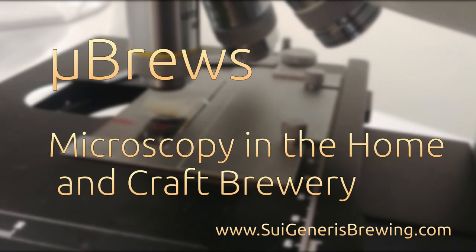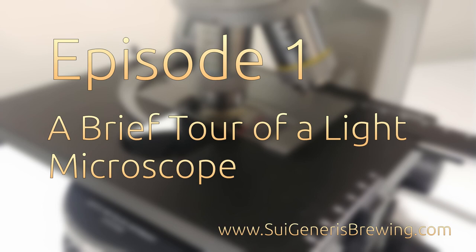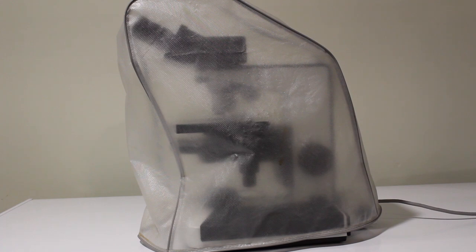Welcome to the first episode of µBrews, my new video series on how to make the best use of a microscope in your home or craft brewery. In this video, I'm going to go over the basic parts, handling, and care of your microscope.